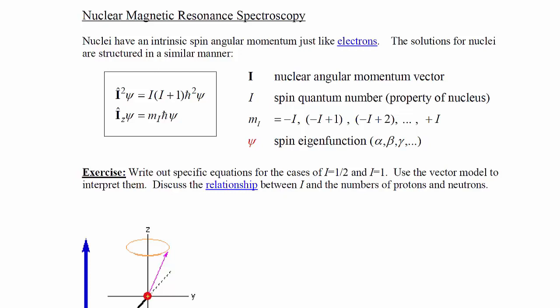In this segment, we're going to review the background and some of the basic equations behind the nuclear magnetic resonance experiment. We're all familiar with this as chemists. We know that the NMR can give us very valuable information about a chemical sample because the spectrum is showing signals from all of the unique nuclei that are present.